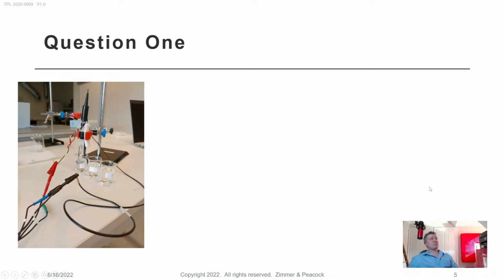So the answer is that silver chloride has a reputation for not being pH sensitive. When you look at the basic chemical equations, you don't expect it to be, but that doesn't mean you shouldn't test these things. There can be phenomena that you don't understand. So we have actually been testing it recently for some internal reasons.